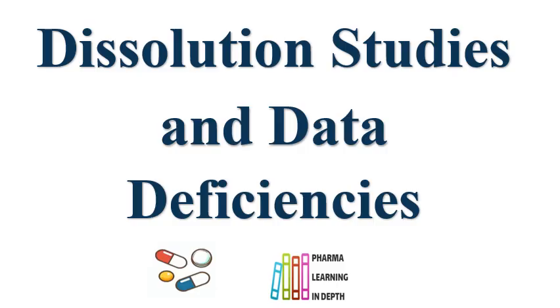As we know, dissolution studies are very important, and these are the studies which can predict the in vivo behavior of the formulation and also the product quality.